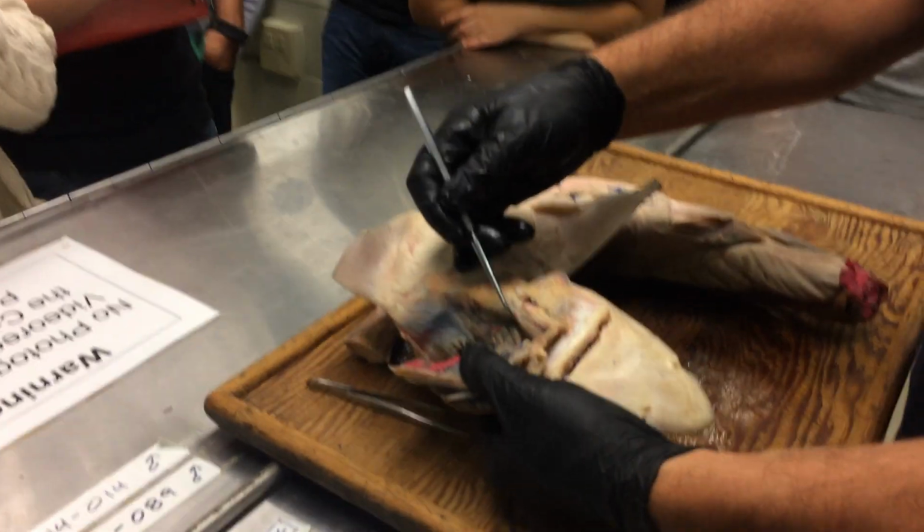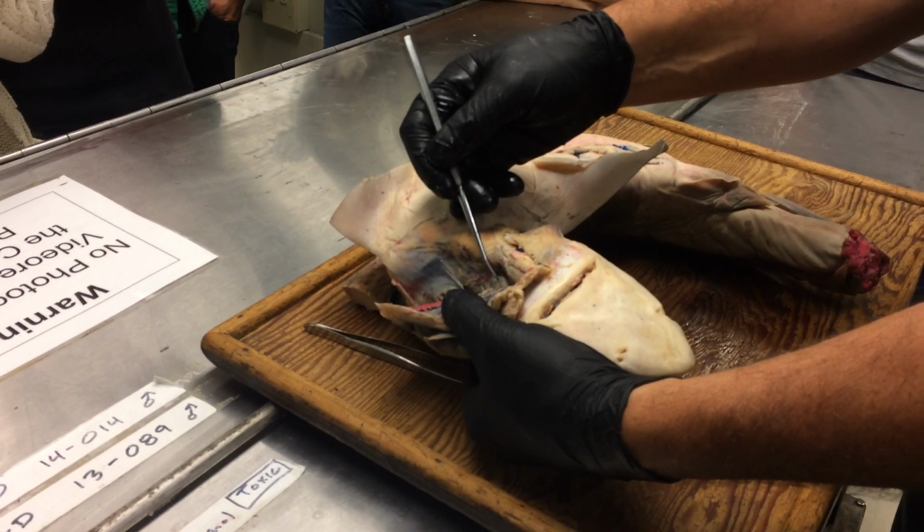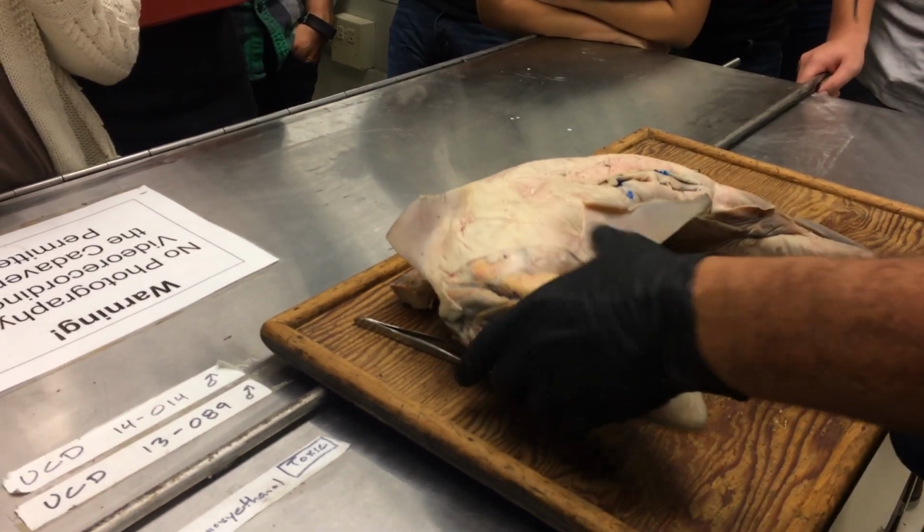Quiz because I felt like everyone hadn't seen them really well, but that's them right in there. Okay. So that completes the hypobranchial muscles.